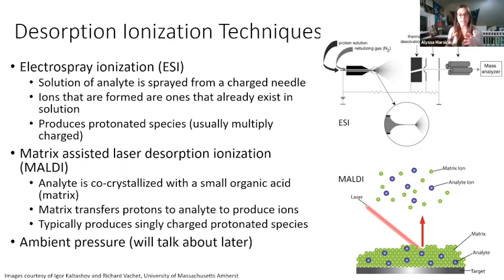Again, this is not something we commonly do. Mass spec is a destructive technique. Luckily, it doesn't use a lot of sample, so we don't really lose too much. But they collected the sample after it went through this instrument, and the virus was still active, right, after going through this process. So electrospray is really, really cool.